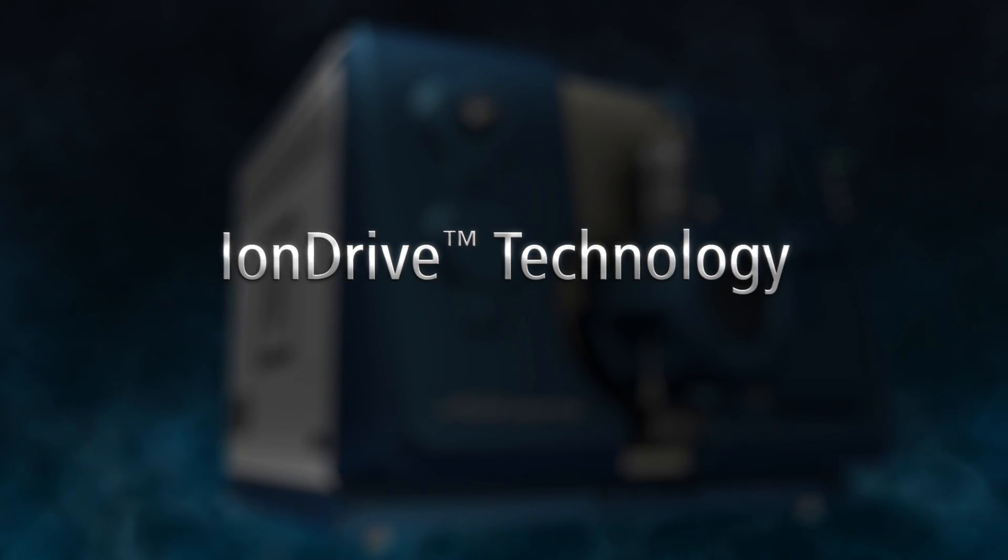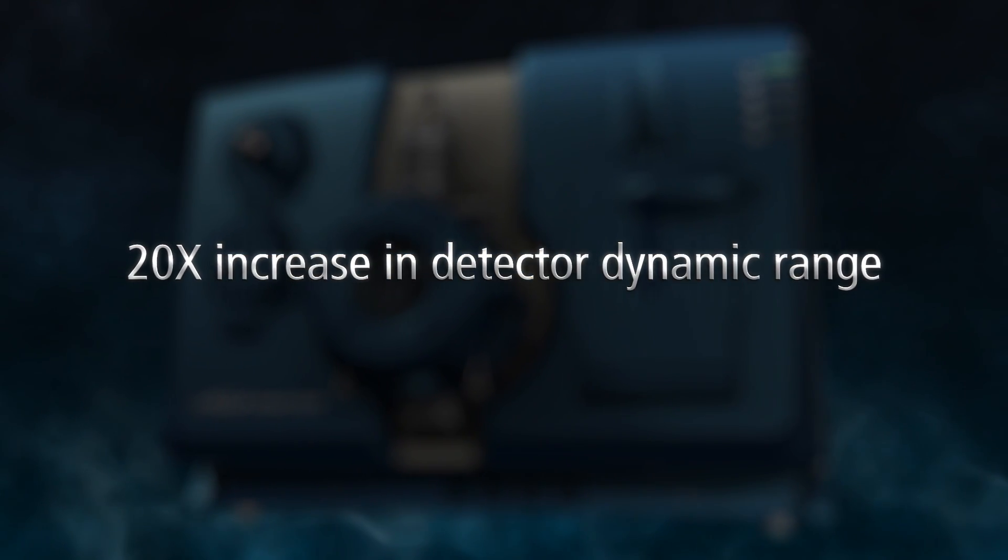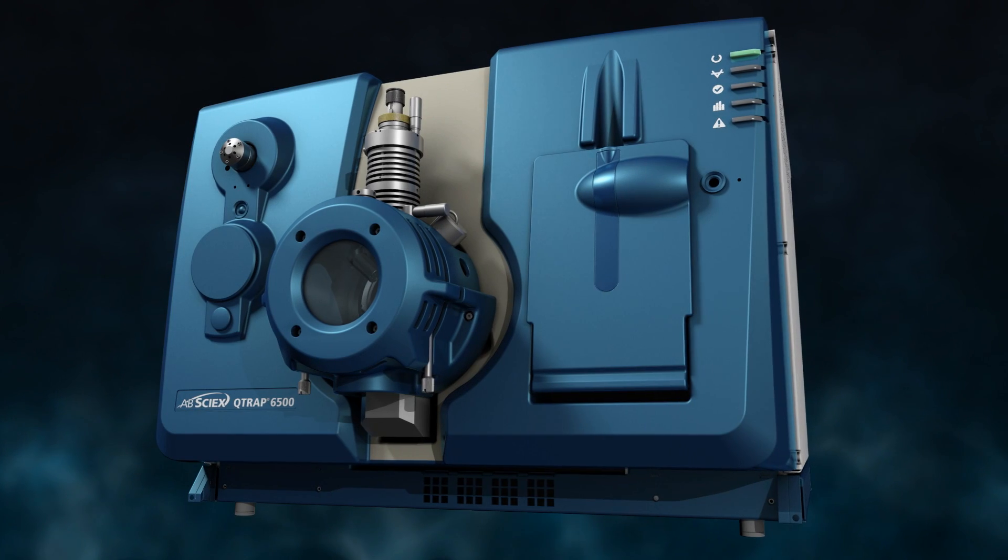The world's most sensitive triple quadrupole with up to 10 times increase in sensitivity and 20 times increase in detector dynamic range, all with no compromise in mass range. Nothing has changed, except everything.